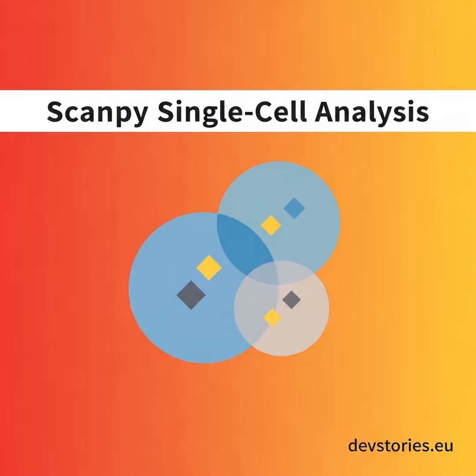Scanpy Single Cell Analysis, Episode 5 of 16. Out of the roughly 30,000 genes in the human genome, most are just doing basic cellular upkeep. If you try to analyze all of them at once, the sheer volume of baseline activity will drown out the actual biology you're looking for. To find the real signal, you need feature selection and highly variable genes.